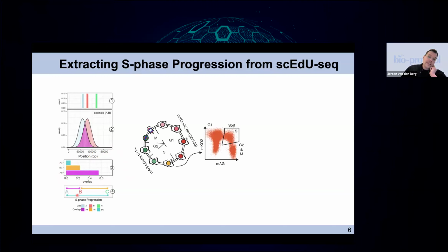In order to validate this, I need to explain the Fucci system a little bit better. So the Fucci system is a ubiquitination-dependent cell cycle indicator, which is tagged with fluorescent probes. And you can basically see it as a circular progression, as you can see over here.